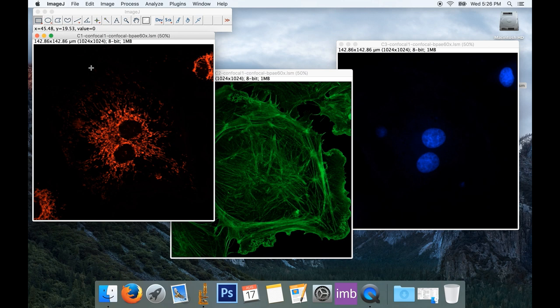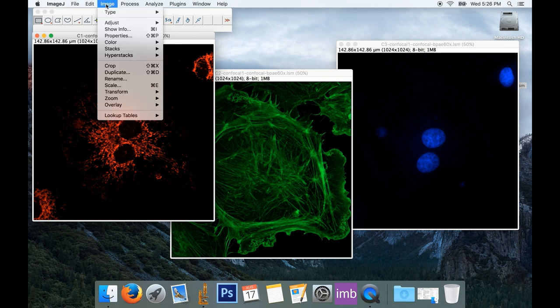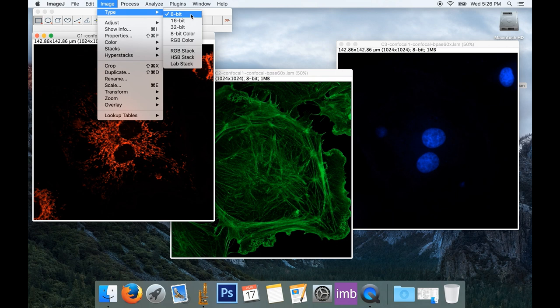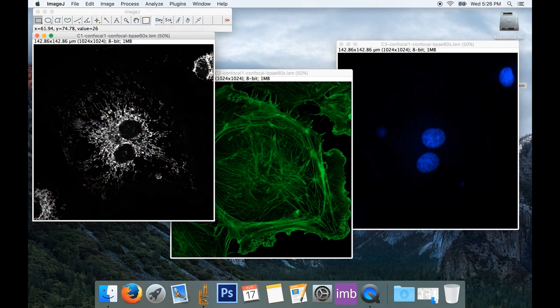So to do that, I'm going to select my image or one of my images, and I'm going to go back up to the menu to Image, Type, and choose 8-bit. And right now you can see that 8-bit is already selected. But if I select it again, my image changes from an indexed color image to a grayscale image.